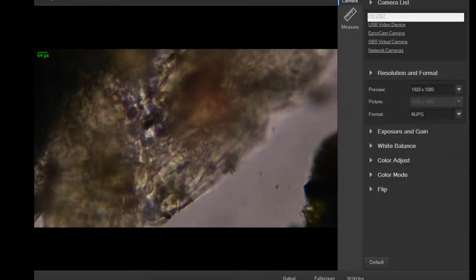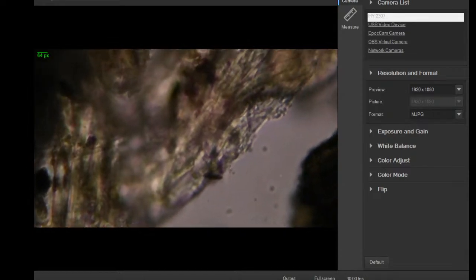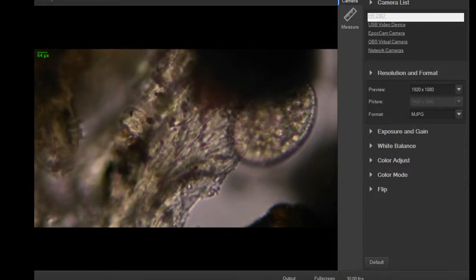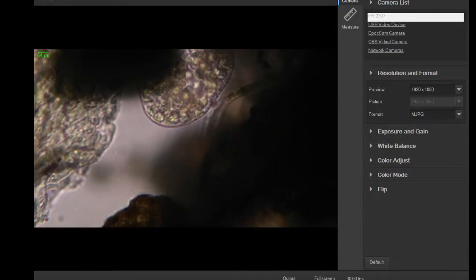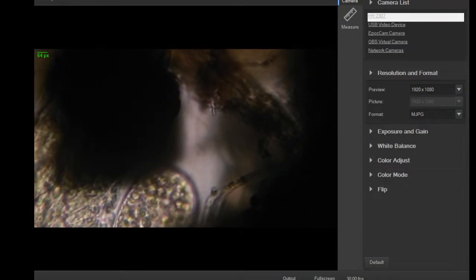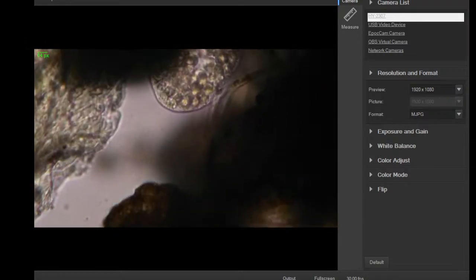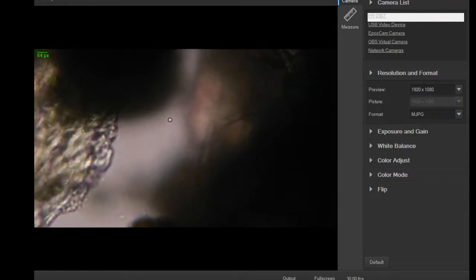Alright, that's two. Oh wait, he's back. Come back, come back. Get close enough and you actually can see some cool stuff. A lot of structure in the cell there. Tons of contractile vacuoles in there. And you can see the 3D structure as it rotates. Oh, there's another little guy in there. Might be one of those ones I saw earlier. It's a bit smaller.